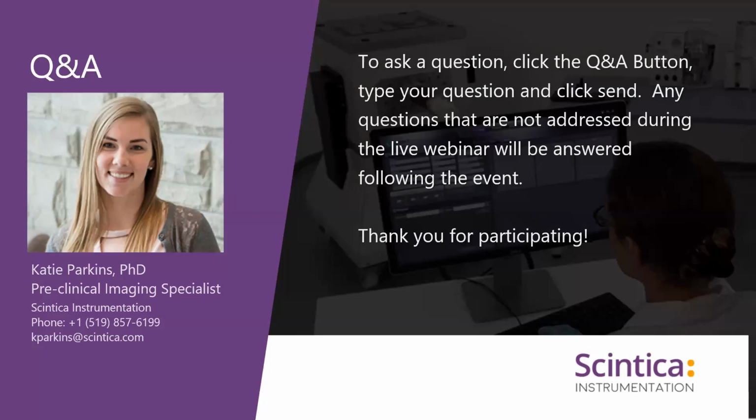Great. So speaking specifically about the brain, when imaging the brain with this type of imaging modality, would you be able to do it by creating a cranial window? Obviously the skull would need to be removed to access the brain, but if you were able to place a cranial window, could this type of technology be used?